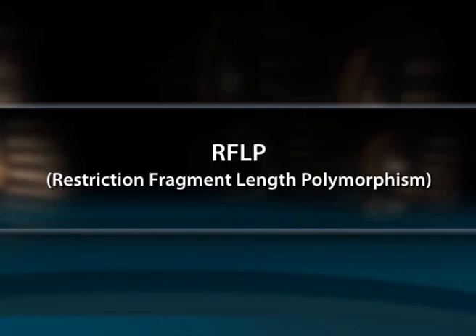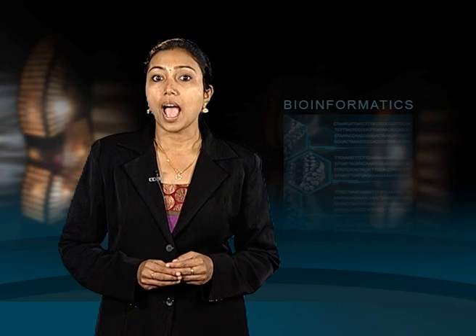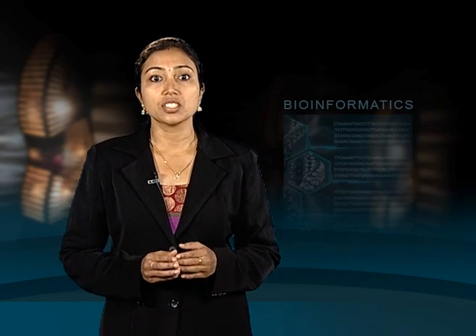RFLP, or restriction fragment length polymorphism. Restriction fragment length polymorphism was invented in 1984 by Alec Jeffreys, a technique that exploits variations in homologous DNA sequences. In RFLP analysis, the DNA sample is broken into fragments and digested by specific restriction endonucleases, and the resulting restriction fragments are separated according to gel electrophoresis.